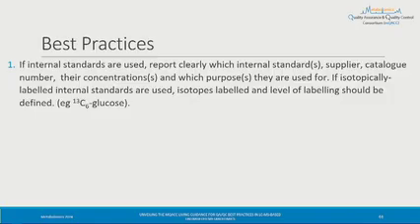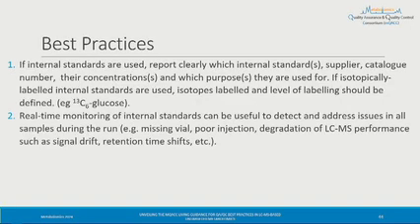So the purpose can be something as simple as retention time locking to get retention indices. It could be something like checking the extraction quality and so forth. So it's really important to specify purpose because not all labs use it for the same purposes. And then if you're using isotopically labeled internal standards, which isotopes are labeled and level of labeling should also be defined.